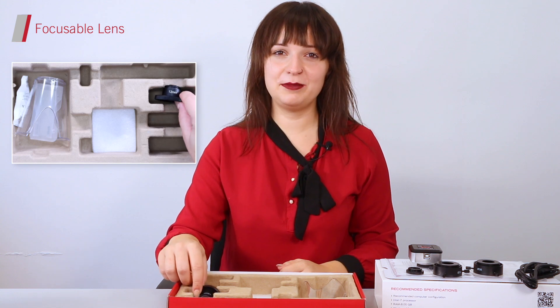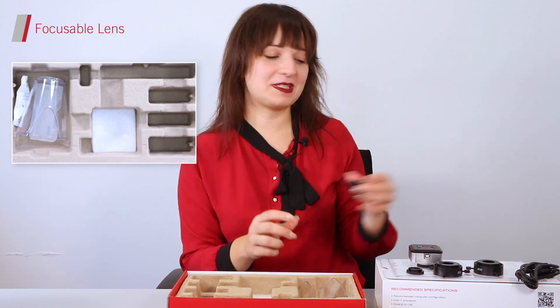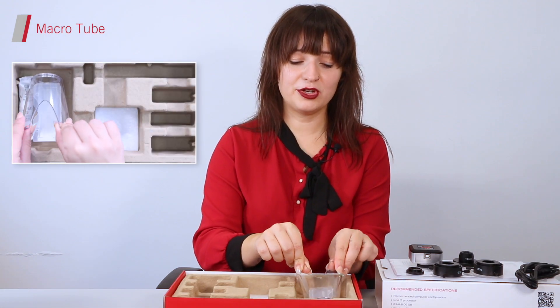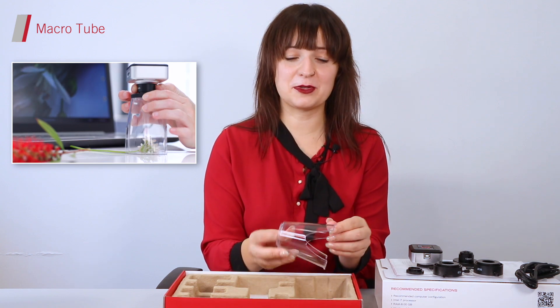Don't forget that you will need to be using your focusable lens to adapt your camera with either an eyepiece adapter or the next item in the box. If you're looking to take macro images, your camera can be directly attached to the macro tube instead of your microscope.